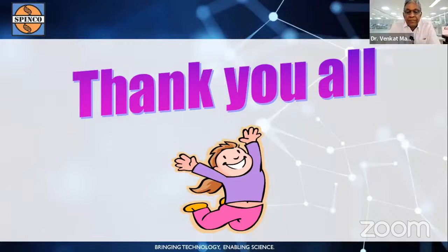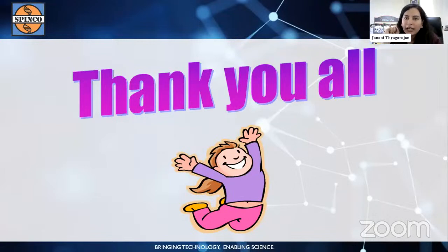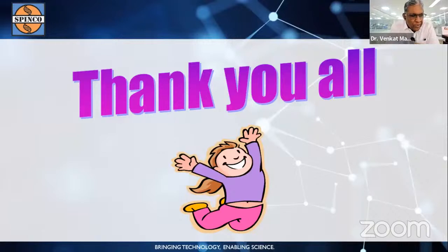Ashmita Dinmar is asking how to analyze crude extract to identify microbial secondary metabolites. Sample preparation plays an important role there. You have to do the extraction very well, otherwise it will contaminate the mass spectrometer.